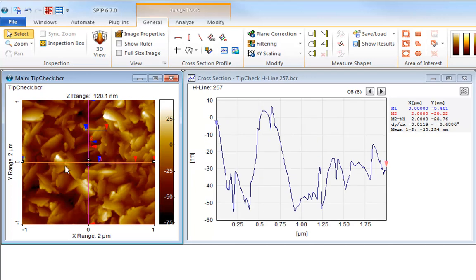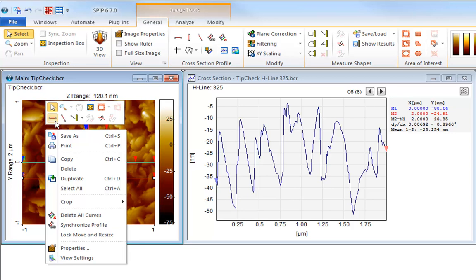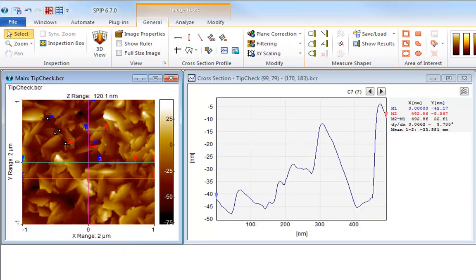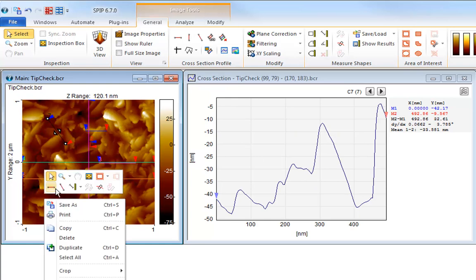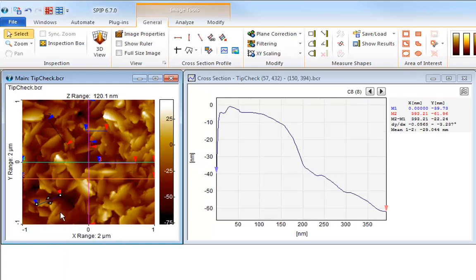You also find shortcuts to the profiling tools on the floating toolbar above the right-click menu. In this way, you can work fast and do not need to switch forth and back between ribbon tabs so often.